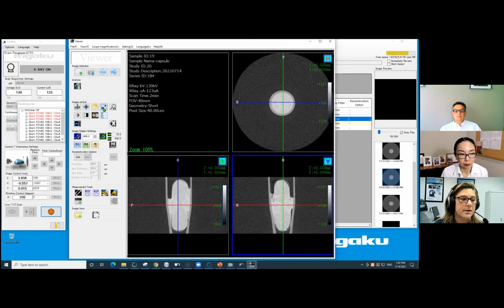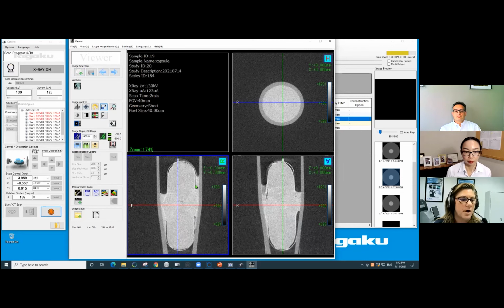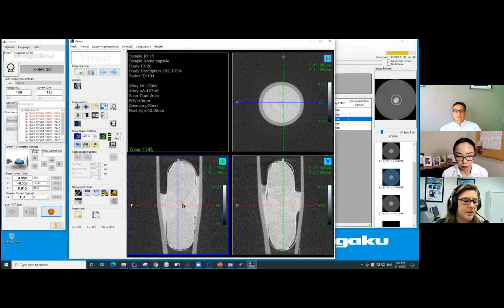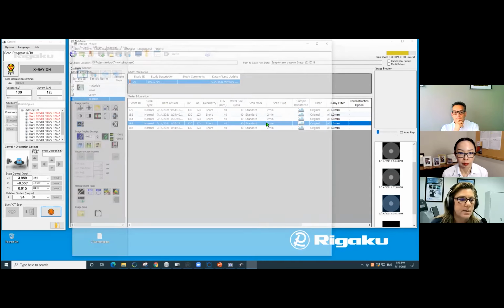Oh, now we're really starting to see some things happen. Everywhere in contact with the water, things seem to be coming apart. We see some contrast difference in the center of the pill, like perhaps there's a void that's starting to fill in. We do see on the ends, however, that the air gaps are still there, although at the bottom left you do see some of the cap dissolving. How about 6 minutes?